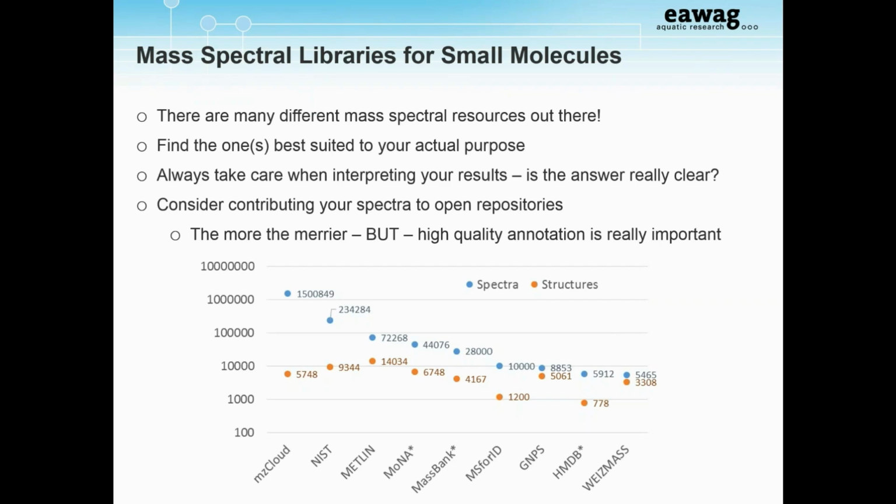I would imagine the basic spectra is very similar, unless you happen to have high resolution peaks, or peaks that were in the low resolution were summarized as one and they would actually split out in the high resolution. And this brings us back to the fact that these accurate mass libraries are still growing, and I can imagine we would have to start getting EIMS libraries happening.